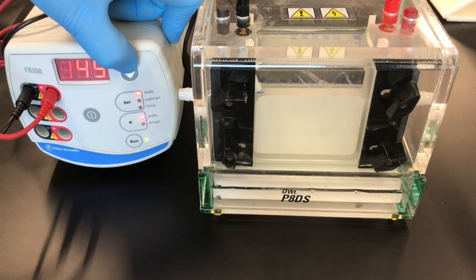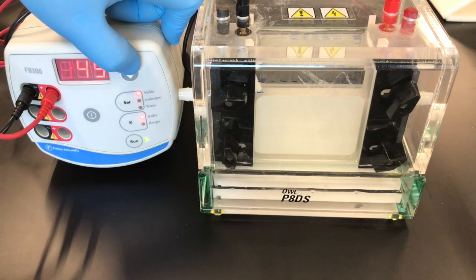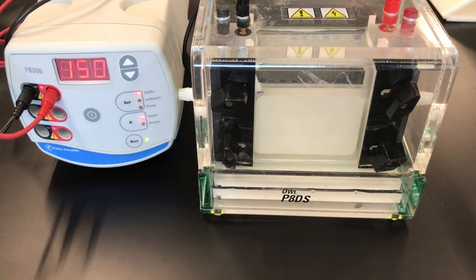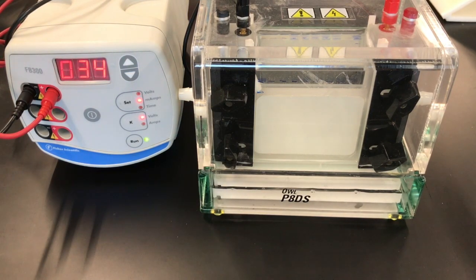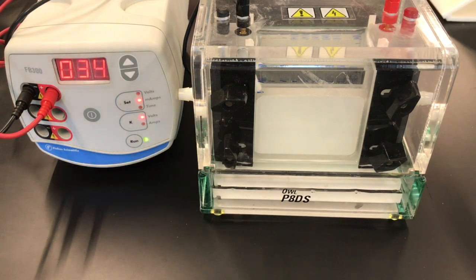We're going to run it at 150 volts in order to get the samples past the stacking gel. Once the samples have traveled through the stacking gel and have reached the resolving gel border, then we can turn it up to 250 volts and let it run at 250 volts for the remainder of the gel.